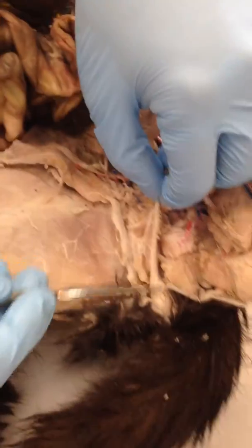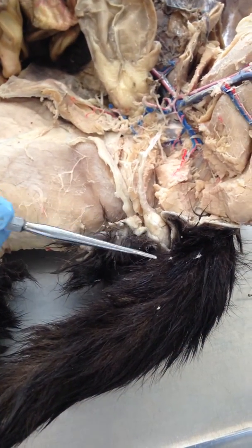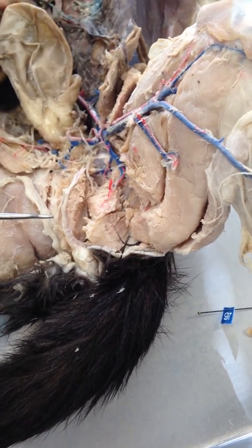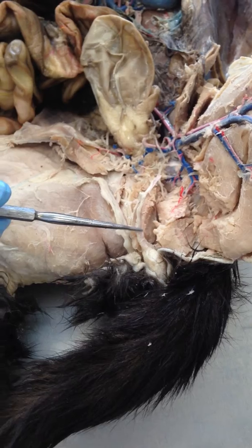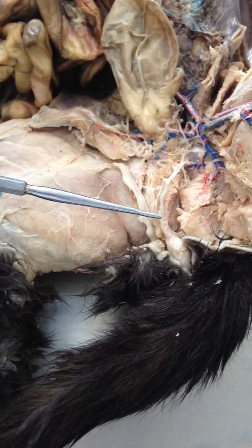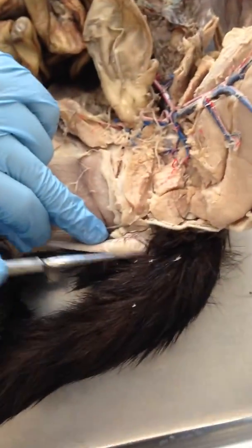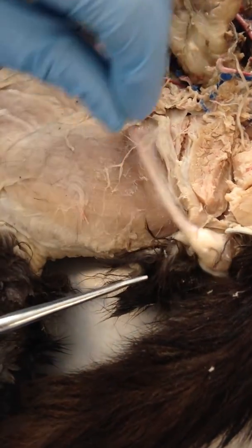And so then here's the testes, and it's wrapped in that sac thing that I forgot the name of, the epicardium? No, that's definitely not it. I think the UG system wrapping around the testis is the tunica albuginea and the tunica vaginalis. That's under UG systems. Testes. Epididymis? Well, the epididymis surrounds it. But in the scrotal sac the tunica vaginalis and the tunica albuginea are part of the leathery covering which you removed, which is good.